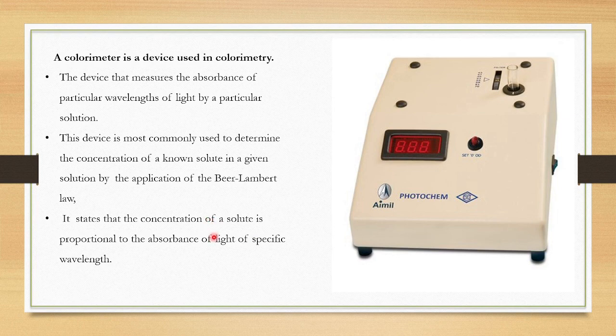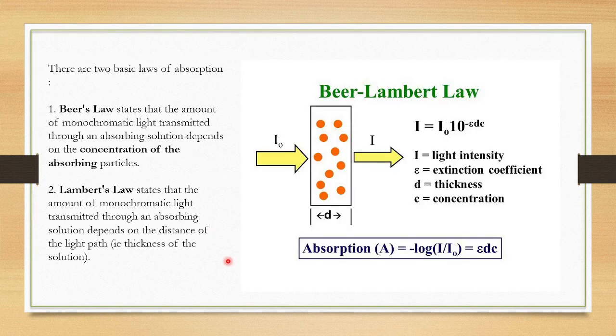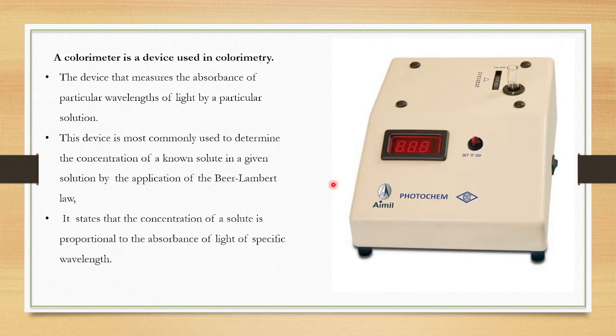The concentration of the solute is proportional to the absorbance of light of a specific wavelength.